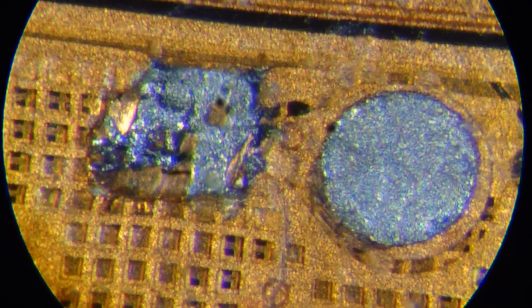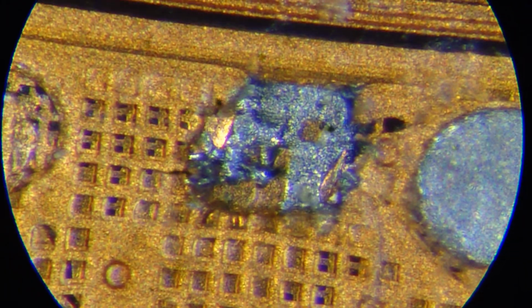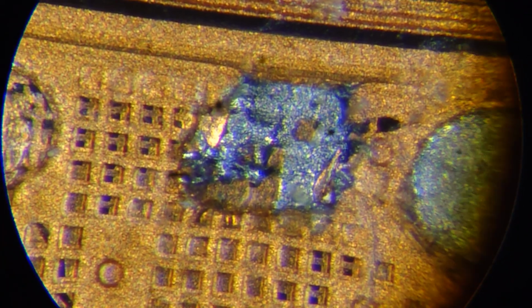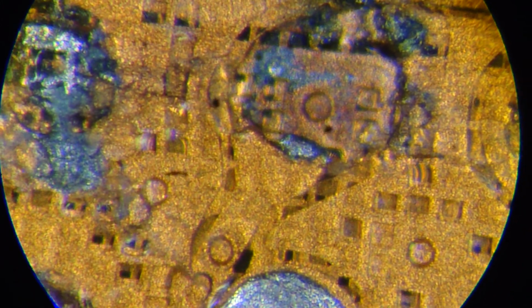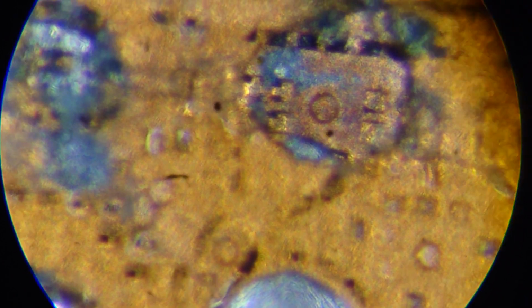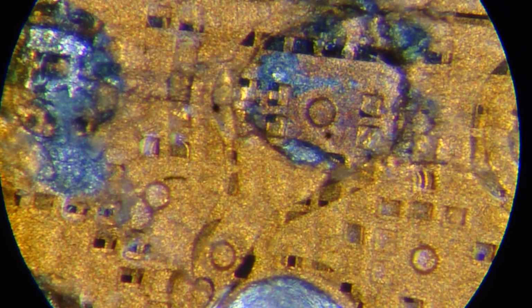Okay, so let's see what we have got here. I guess we have at least two layers here. Let's move further. What have we got in here? Another place with obviously two distinctive layers. Even three: its bottom, its middle, and its top layer.